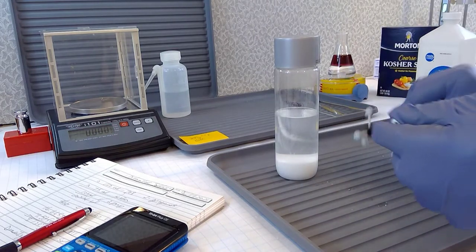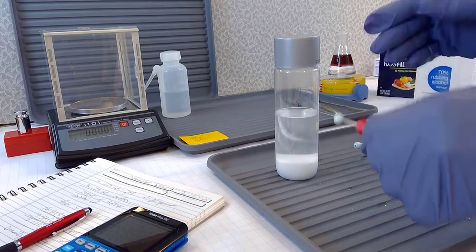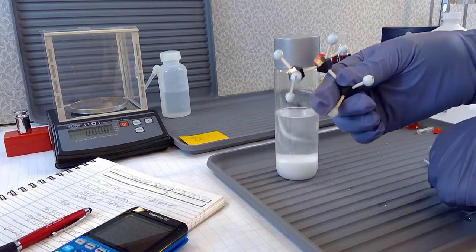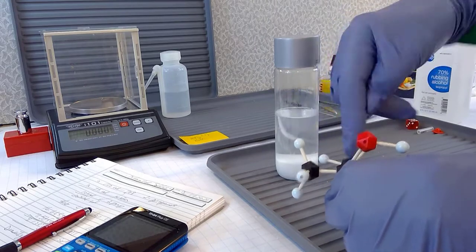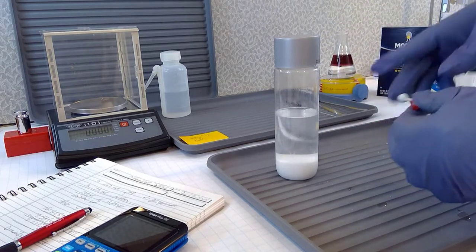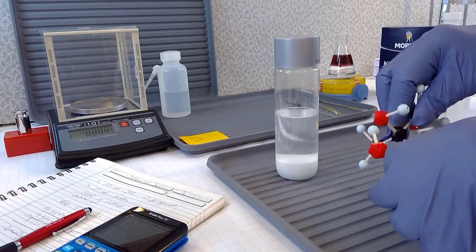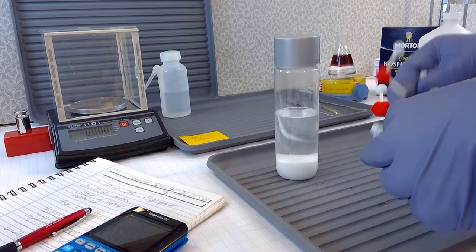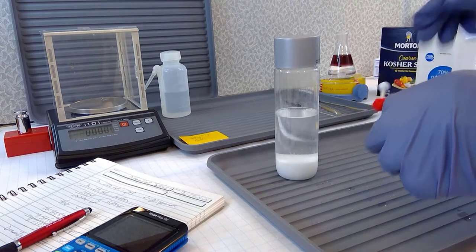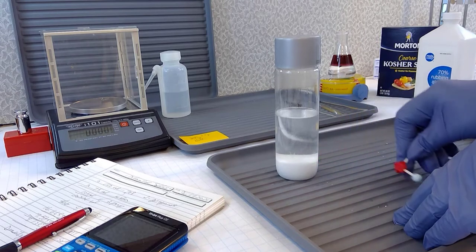And as they do so, because water's got 2 of these, you're going to have the water attracted to the salt more than this propanol, because the propanol's got London forces here. Not nearly as attractive to ions. So we're going to switch from hydrogen bonding between the water and isopropanol to dipole-ion attractions between the salt and the water.